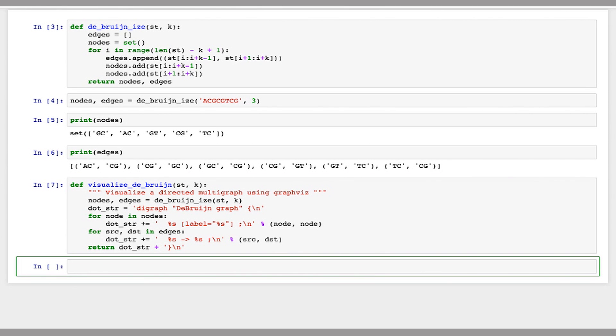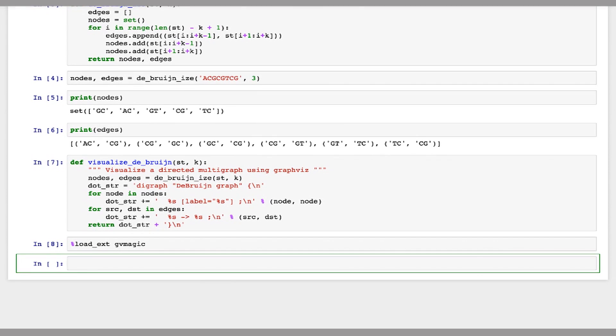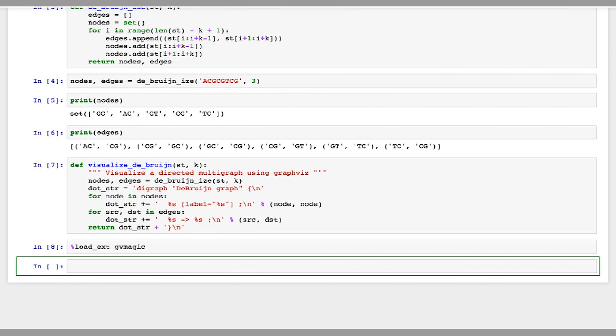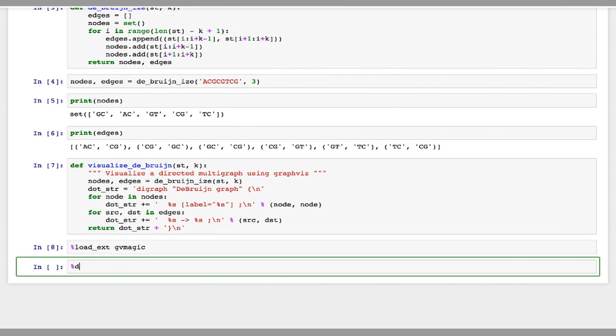So now I'm going to load GV magic. So this is a special IPython plugin that lets us draw graphs basically.